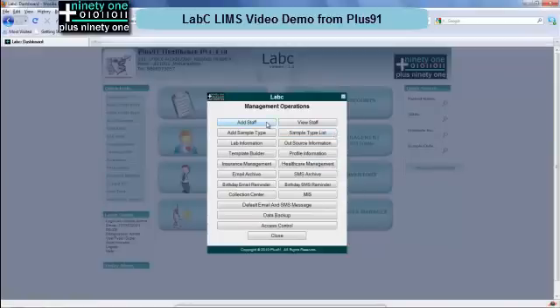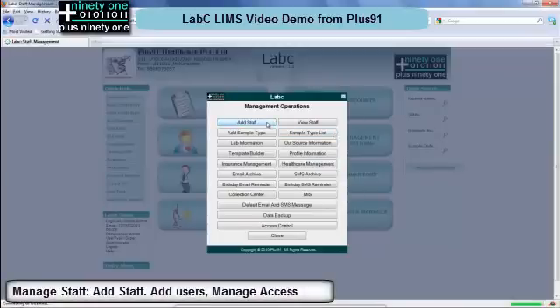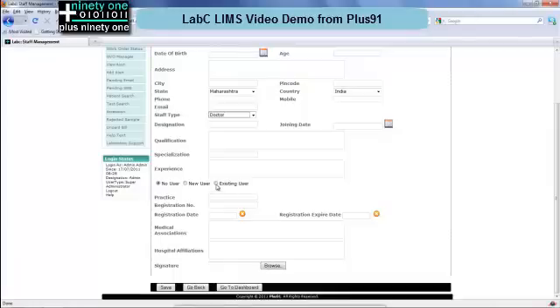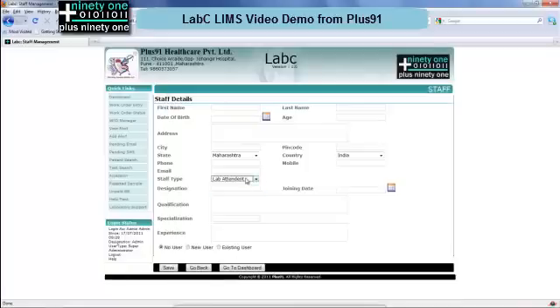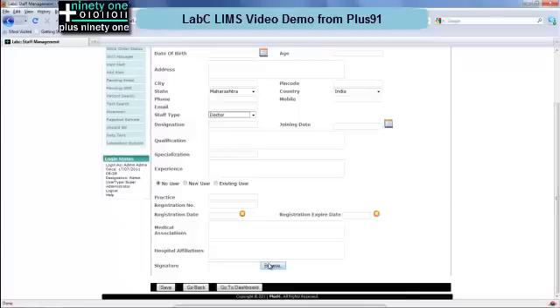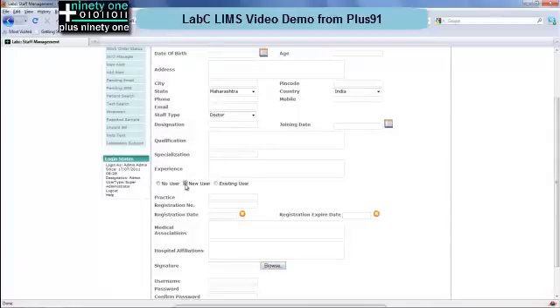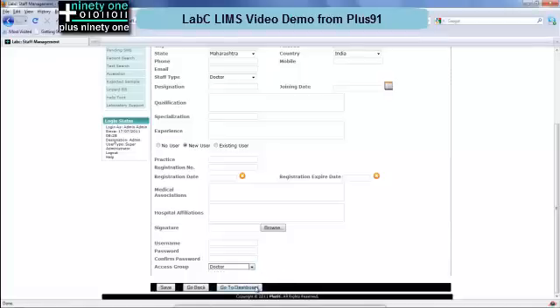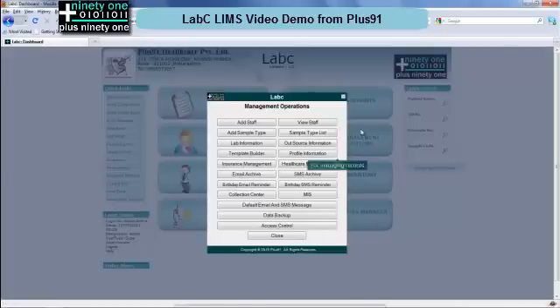The management options include adding staff and users. This is a single window entry. You can select what type of staff is there and what their qualifications are. You can add a new user to actually log into the system or just have a staff entry. In case of a doctor, more details are captured including the signature. Once the user is added you can select what access group they belong to.